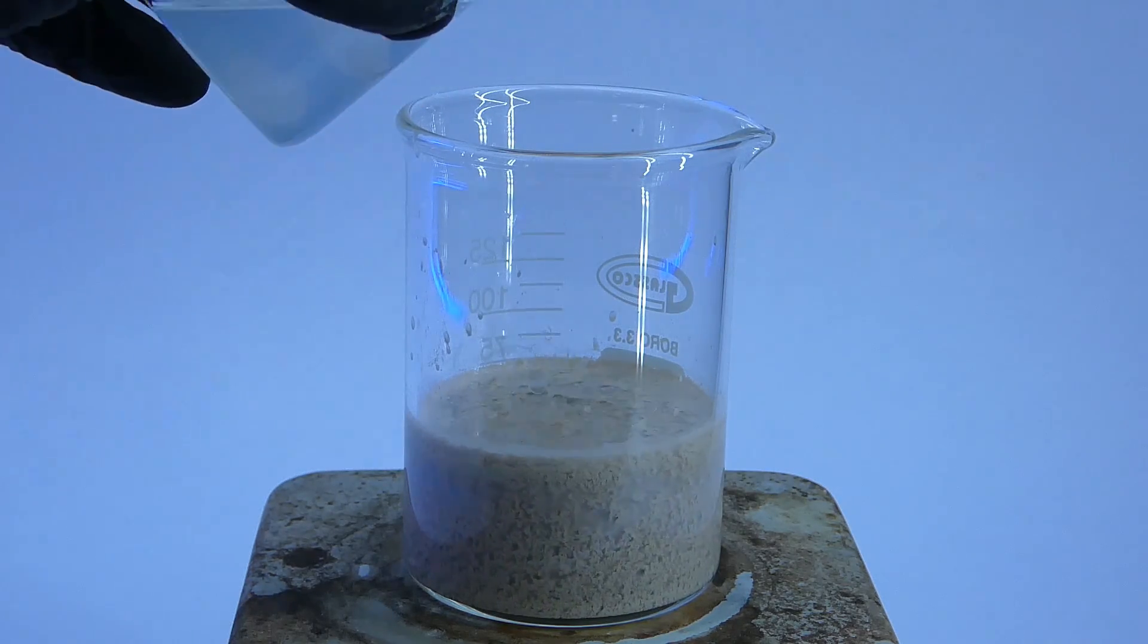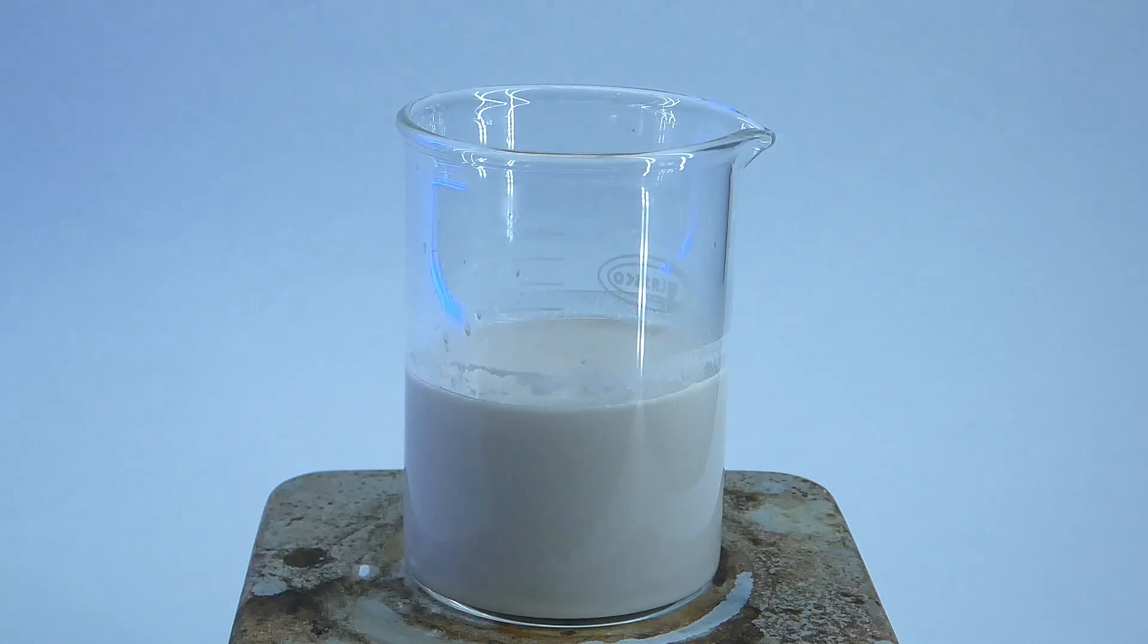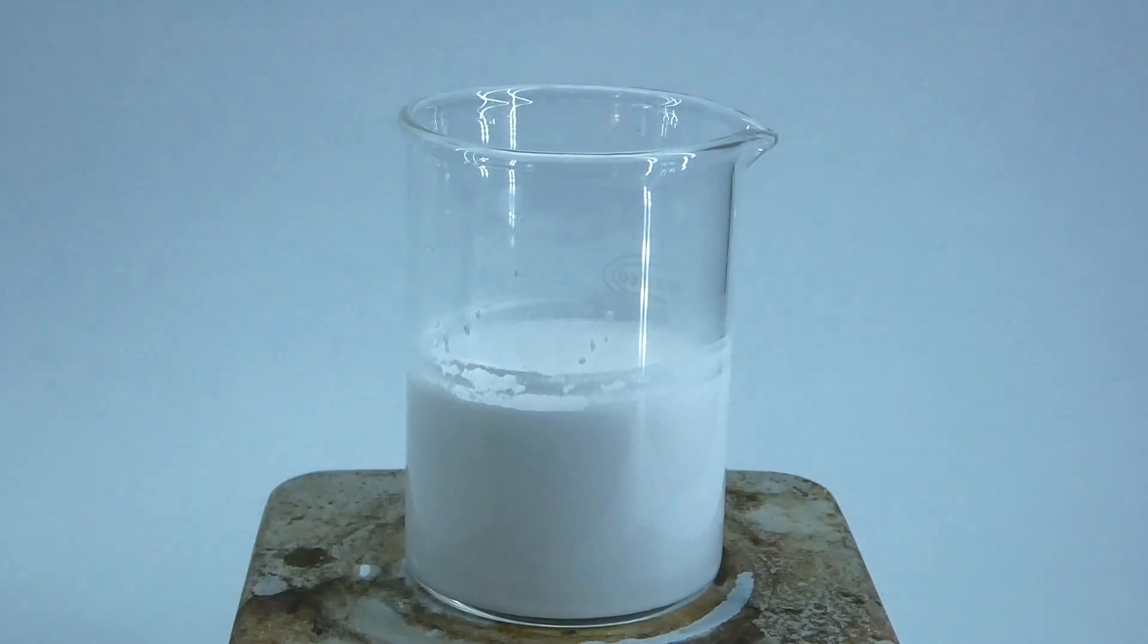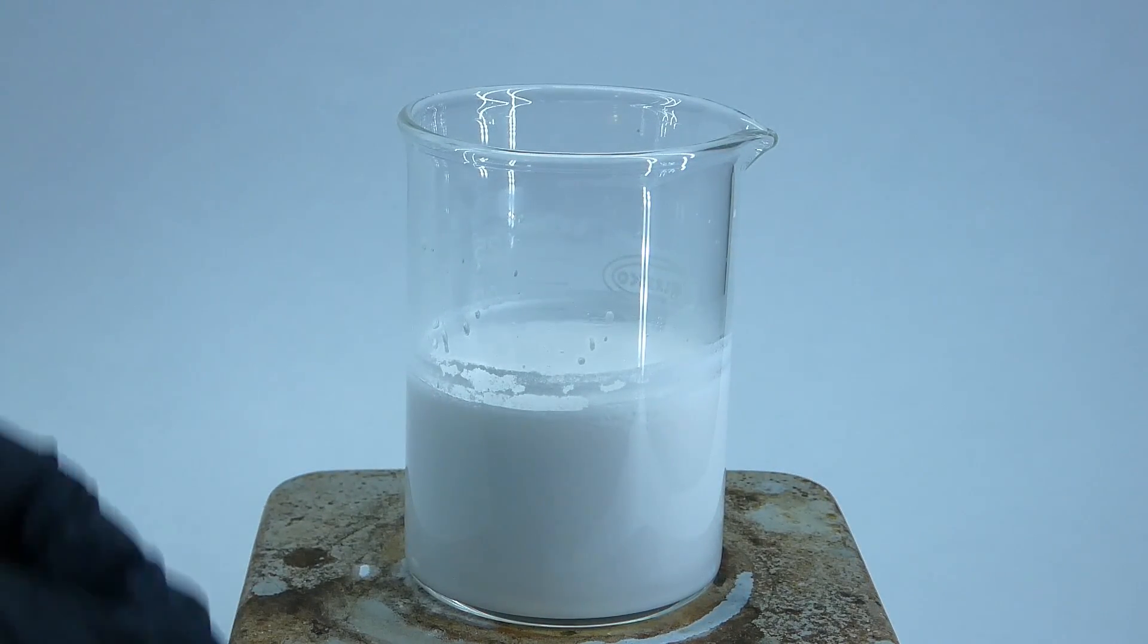At first, nothing seemed to happen, but as time went on, the mixture became whiter and whiter, transforming from chocolate milk to yogurt, because the complex was precipitating out of the solution and forming a thick slurry.